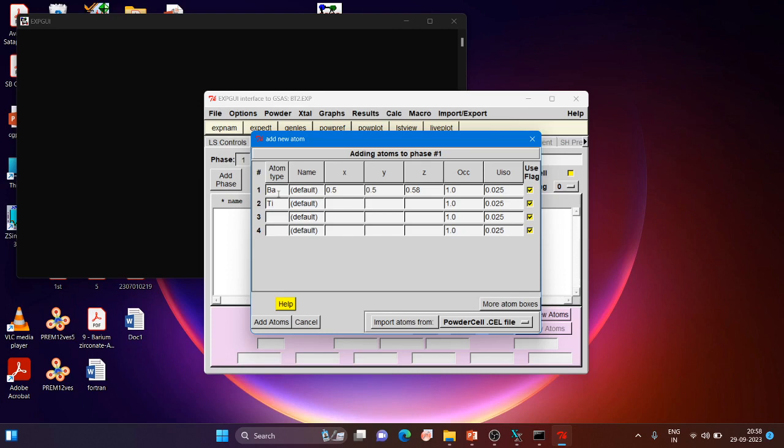Then I'll go to the titanium atom, so Ti. Then I'll go to the XYZ coordinates of the titanium atom, and I'll put here 0, 0. And in the third one, I'll put a different value closer to 0, but not exactly equal to 0. I'll be putting some expected or average values, so I can put 0.10. It depends. Different people take, like, barium is 0.10, and in the titanium case they just put 0.5, 0.5, 0.5. You can also play with those kinds of permutations and combinations.